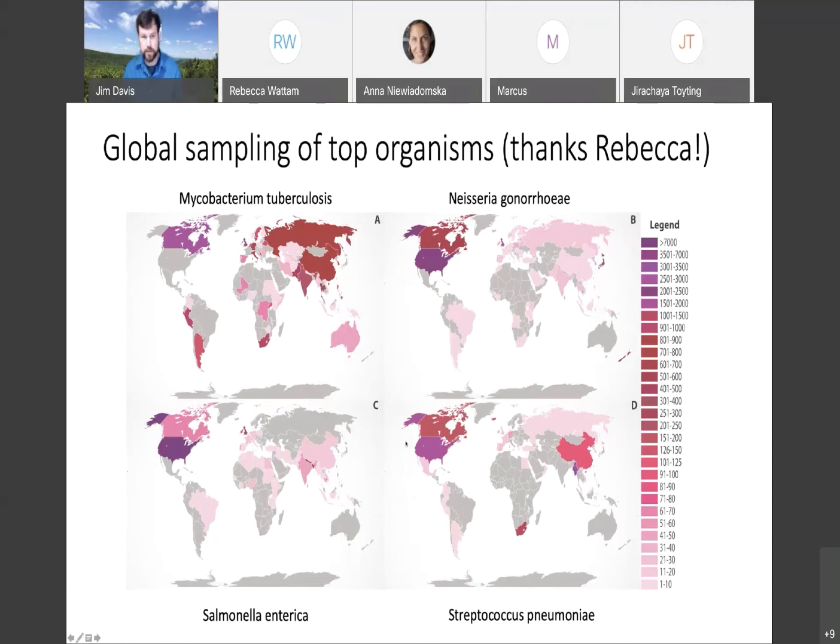That depends on the burden of disease in certain countries, and also the priorities of various funding agencies and monitoring agencies. For instance, for Salmonella, we have a lot coming from the US and Canada. For enterica, these are usually Typhimurium strains for the US and Canada. And over here in the Indian subcontinent, that's a lot of paratyphi and typhi strains from various outbreaks that they've suffered through.